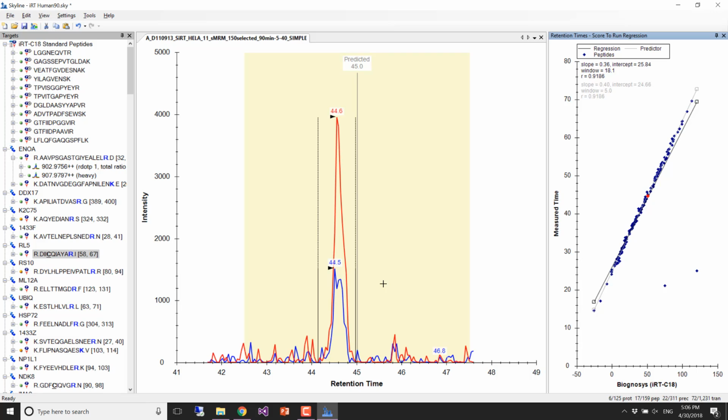Right, that's what I'm saying. Somewhere in the UI in Skyline, we would have to have a checkbox that says make this a function of the width of the peak. We just never implemented that because there hasn't been enough demand for it. It's been mentioned as like, hey, wouldn't this be cool? But nobody has sent us a data set saying it's painful, I can't measure these peptides because of X. If you find that and you're like, I really need this function of the width of the peak thing.